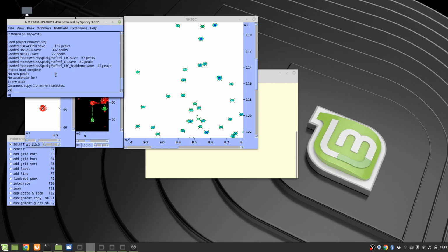Many of my tools for automating tedious tasks will look for the sequence file anytime, so you don't really need to set your sequence file every time. You do SQ when you want to use the stored sequence file. So it's better to put your sequence in like this using the sequence entry SQ.